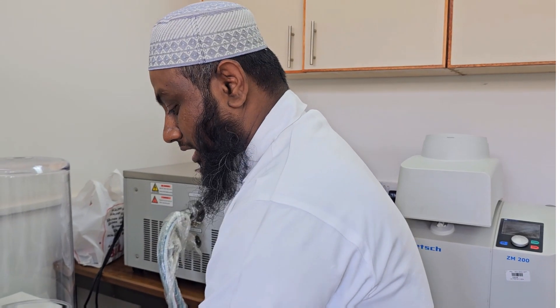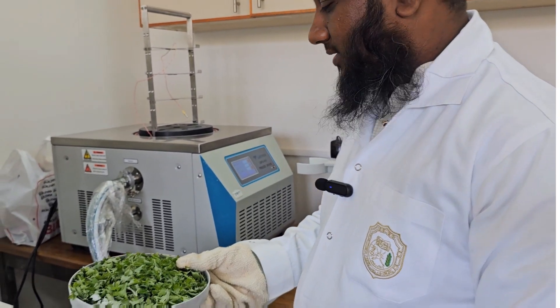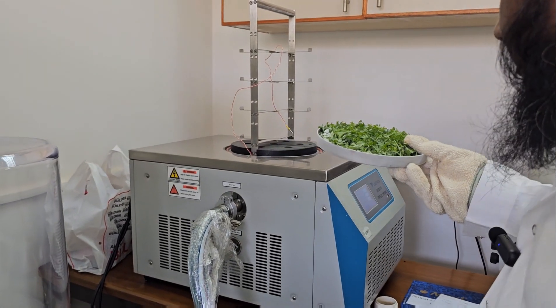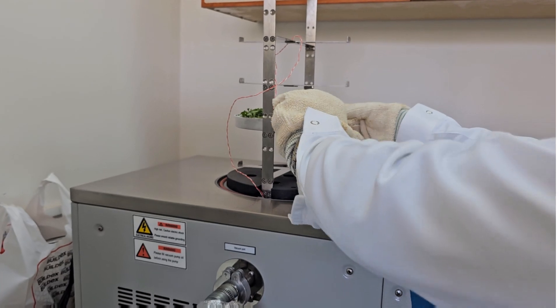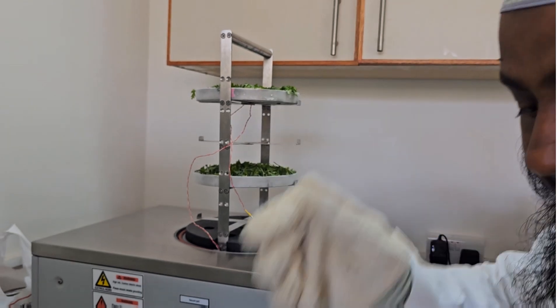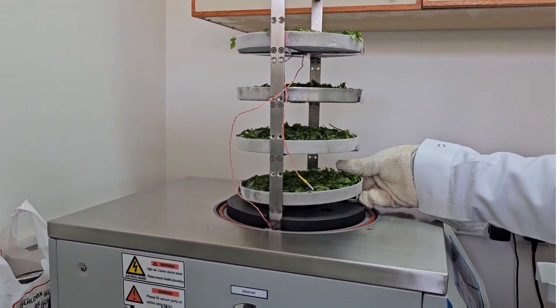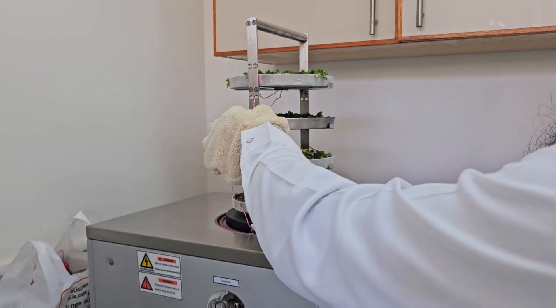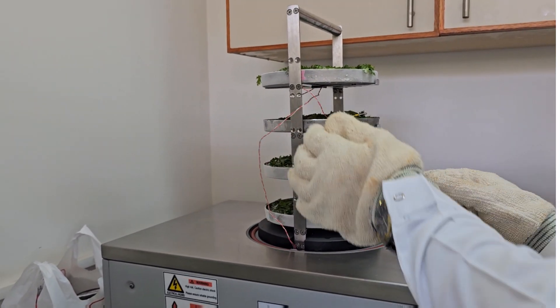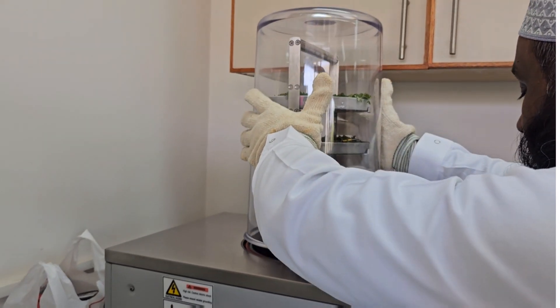Now I am going to place the frozen sample, which was stored at minus 40 degrees C for several hours — three to four hours — into the freeze-dryer chamber. There is a sensor that has to be placed on the sample to maintain the sample temperature. Then I will close the lid to maintain the temperature inside.